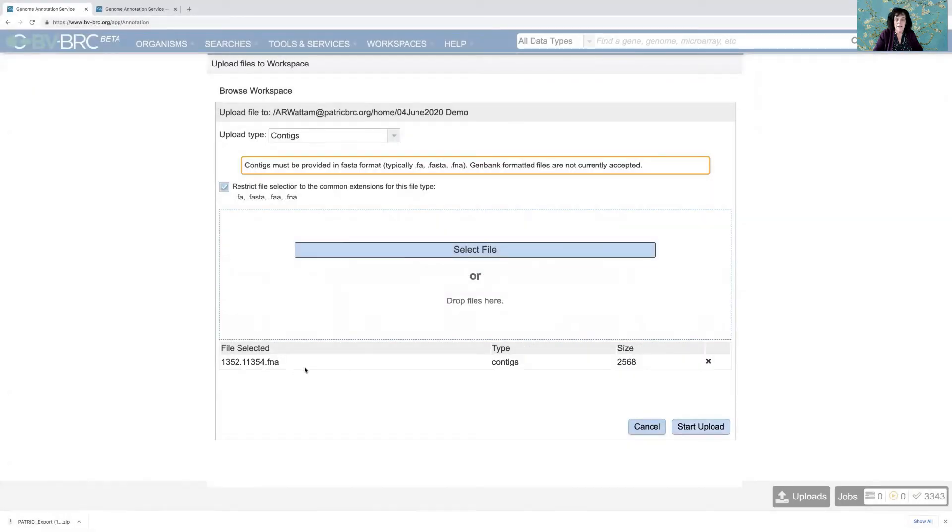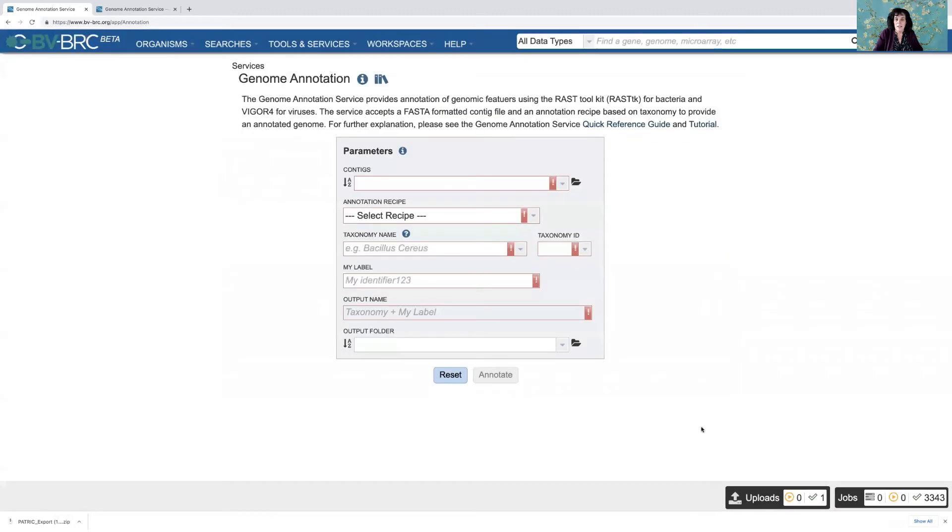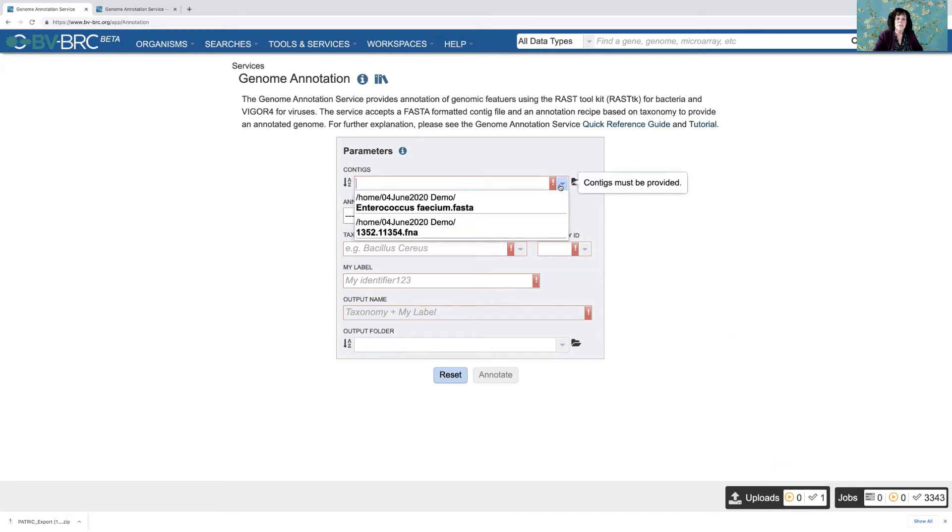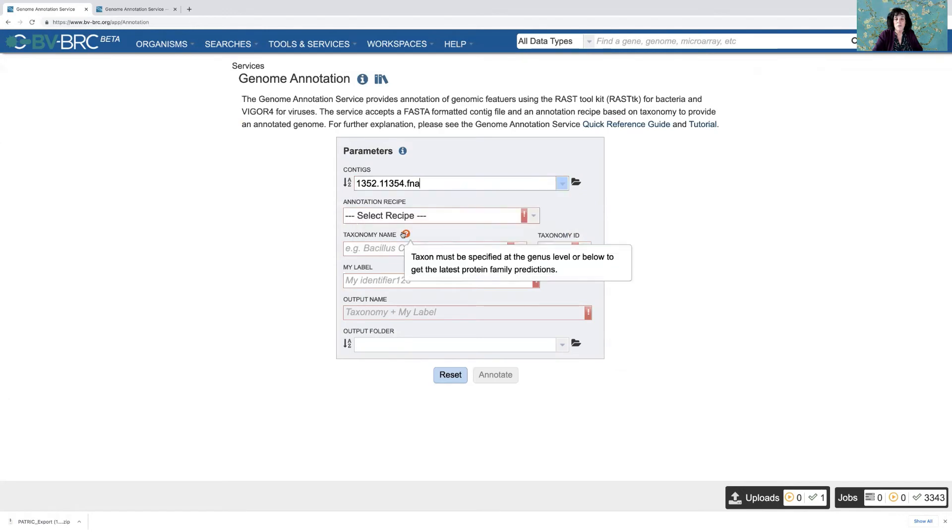So you can see I've got that here. And I say start upload. Now it's important to wait until the upload is complete. And you can monitor that on the upload monitor. And it says it's complete. So I should be able to see it here. And there it is, this 1352.11354. So I click on that.